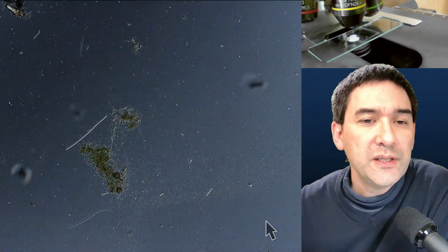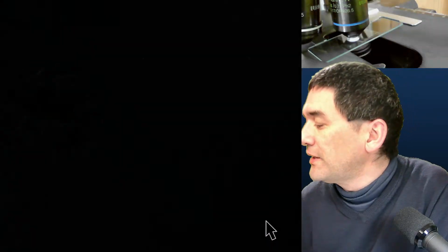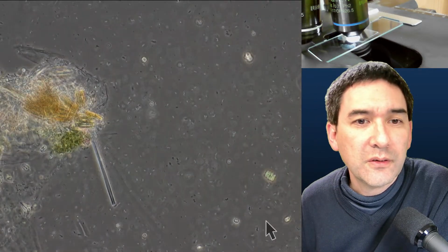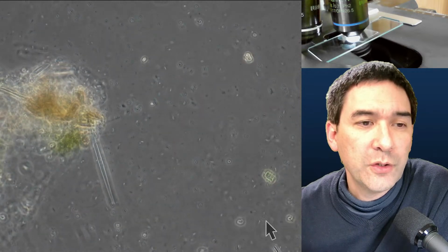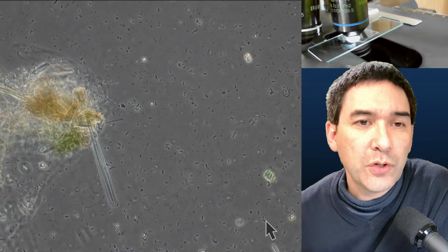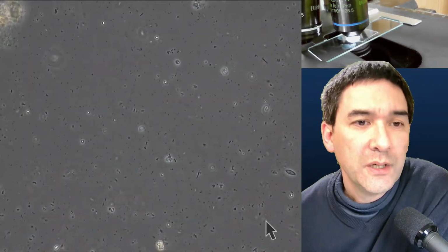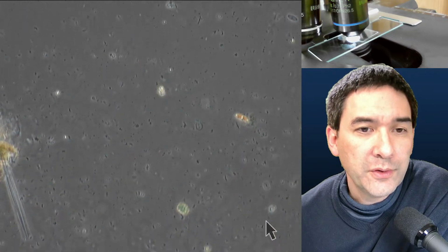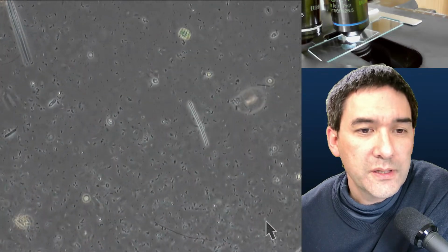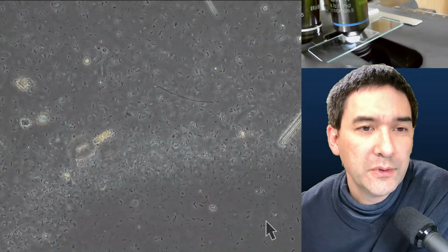Do you actually notice? Or you know what, I'm going to switch over to phase contrast. Okay, that's now phase contrast. As you probably already know from my previous videos, phase contrast is really the way to use for observing bacteria. And look what happens here. Those little dots that are floating around are bacteria. There are a couple of them floating around here. And look what happens. All of a sudden, the concentration really goes up.